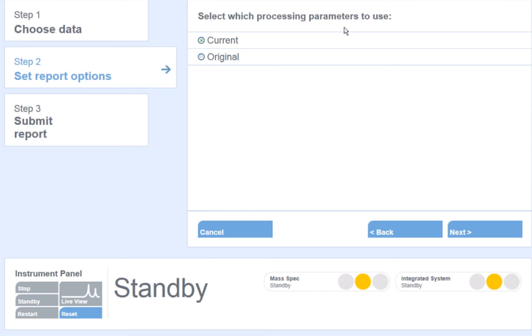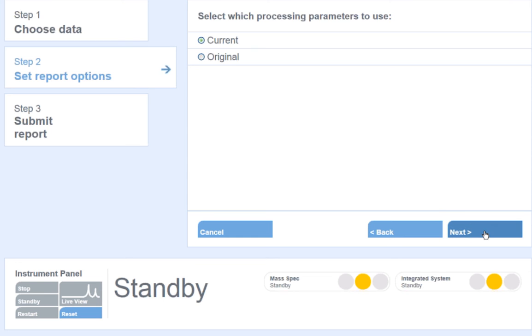Select which processing parameters to use. Data can be processed either using the original quantitation method file or with current, updated integration parameters. Selecting current, the software will use the most recent update to the processing method and use this file to integrate the data.